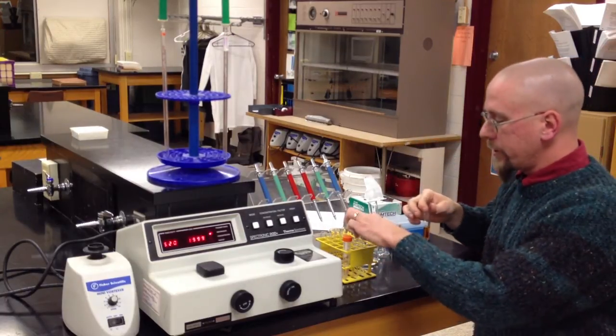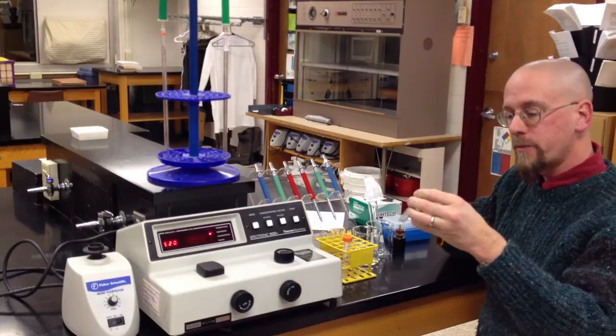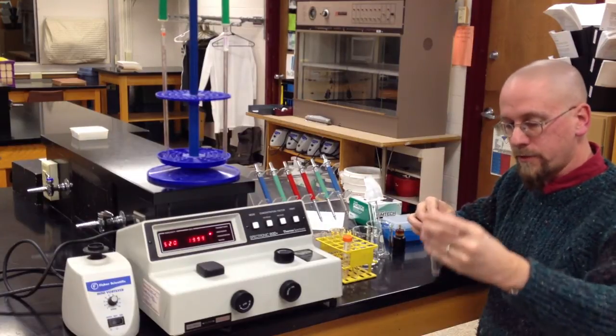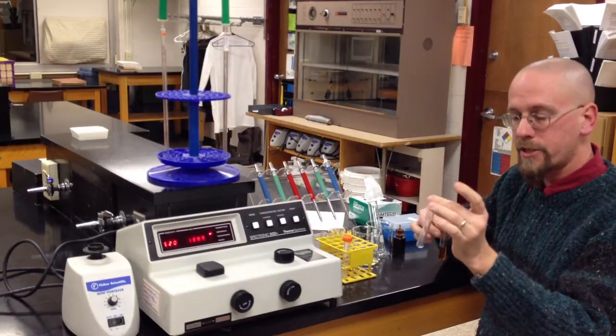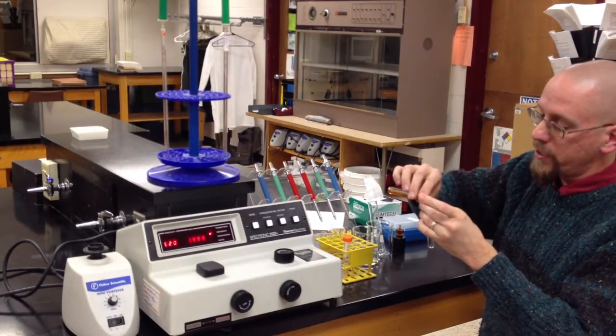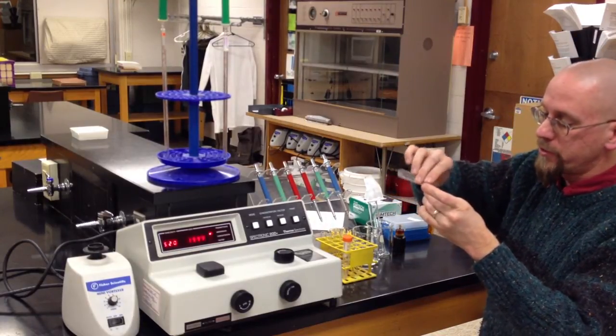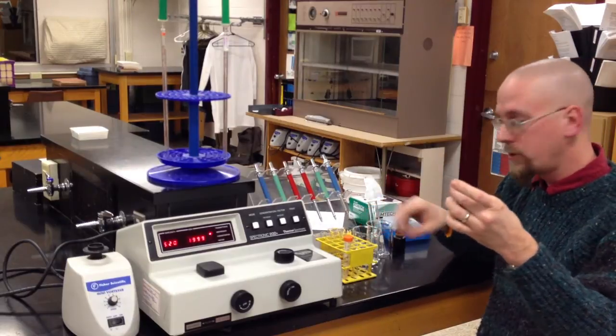Now, in order to do this, these instruments use a special test tube called a cuvette. There will be cuvettes at your station. And you mix things in test tubes and then you pour them into the cuvettes.